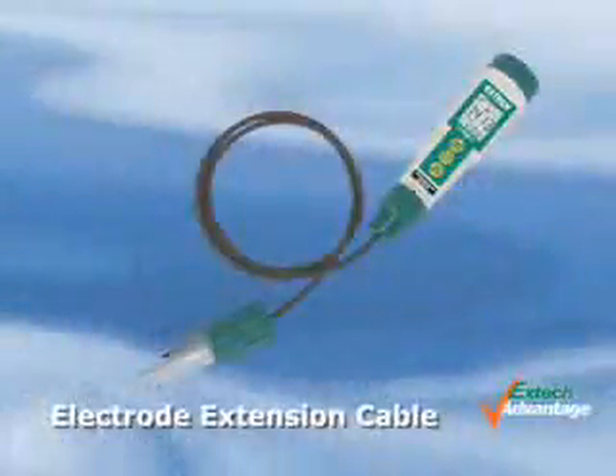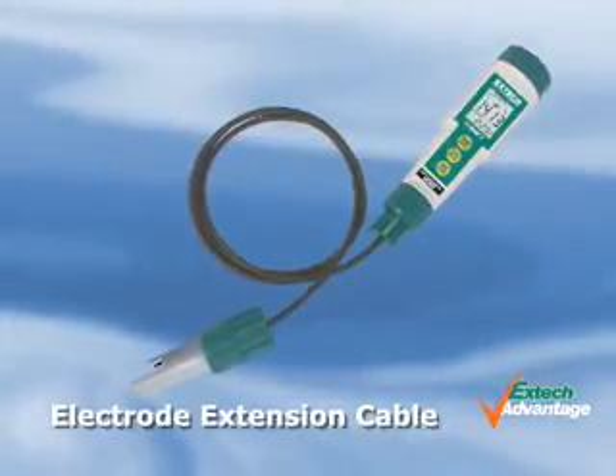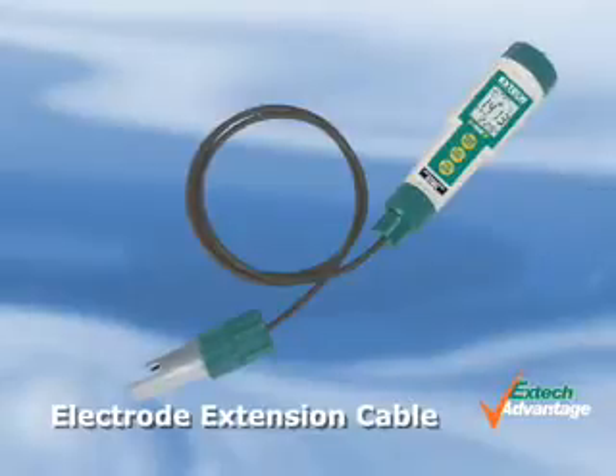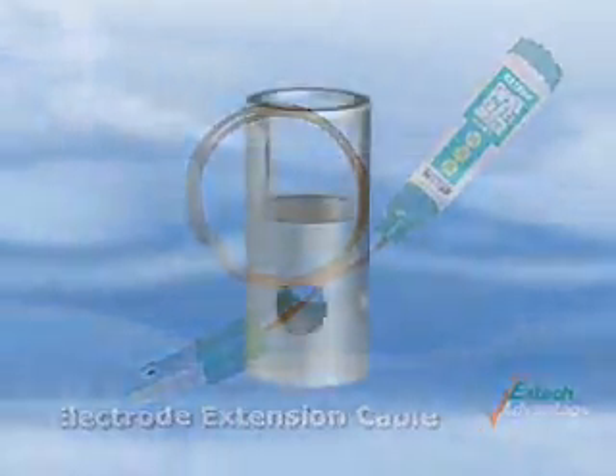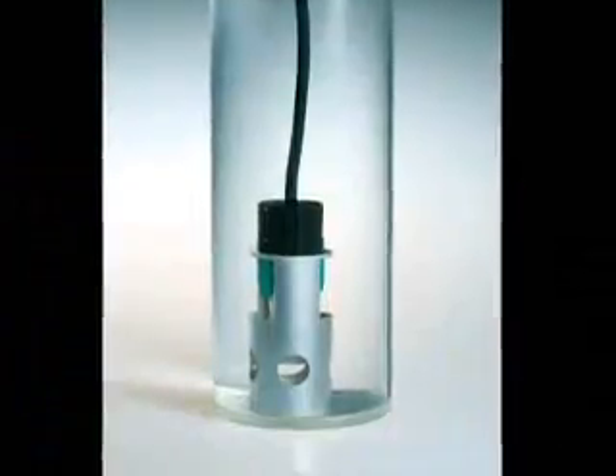An optional extension cable of 1 meter or 5 meters allows for remote measurements, facilitating measuring in difficult-to-reach areas. Also available is an electrode weight to help keep the electrodes submerged in water while taking measurements.